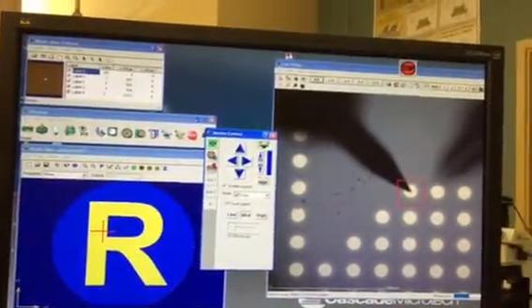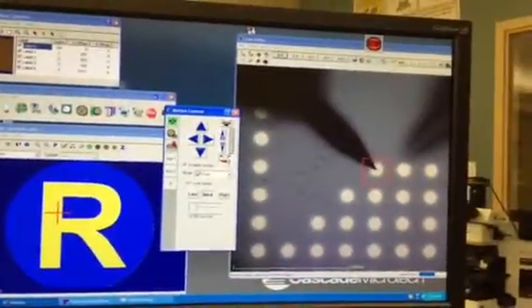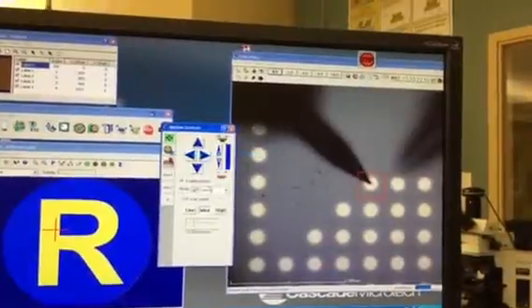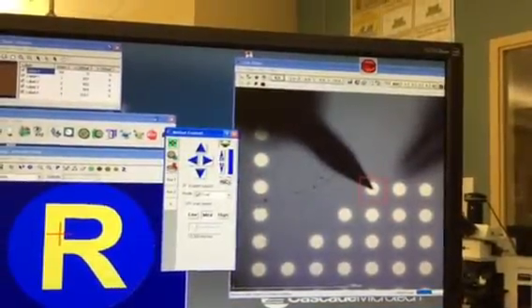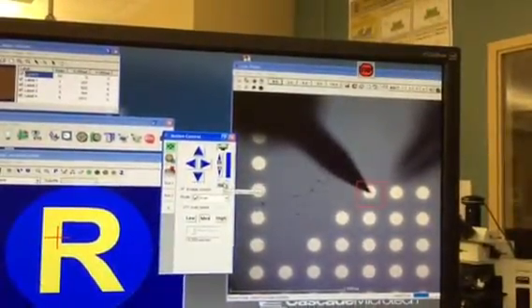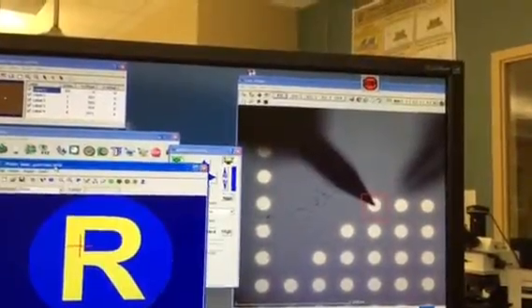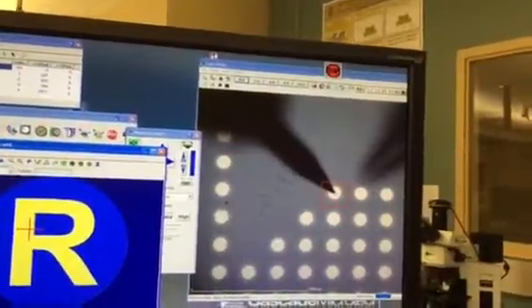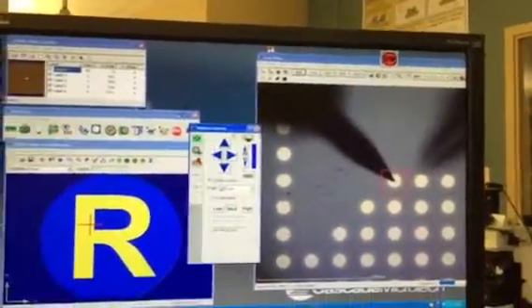Okay, I can set it to there. Oh, it's over here. Set reference. There we go. That's what I was looking for.